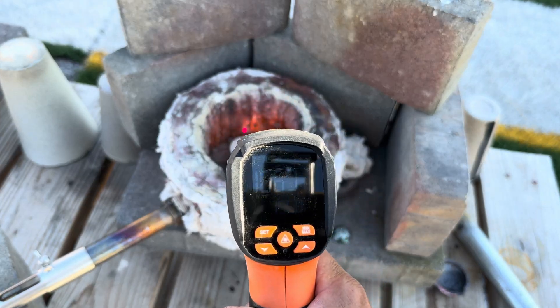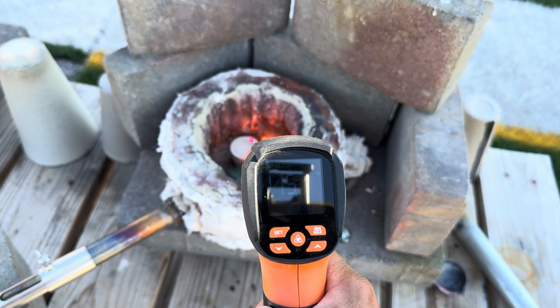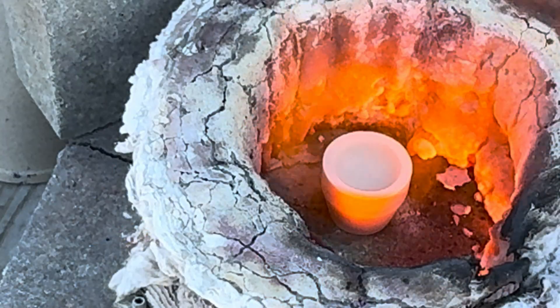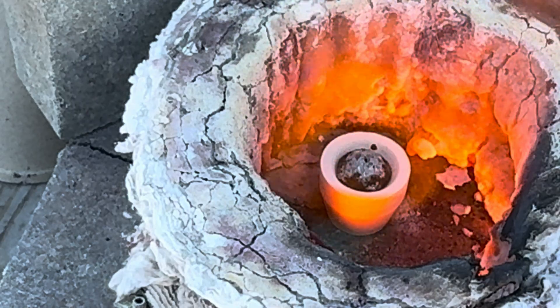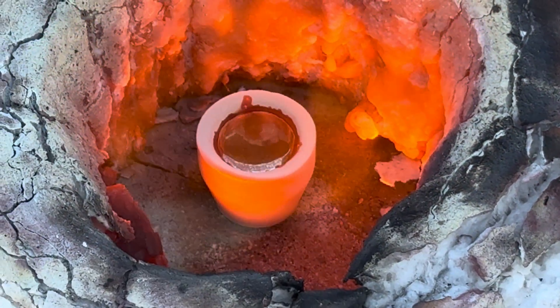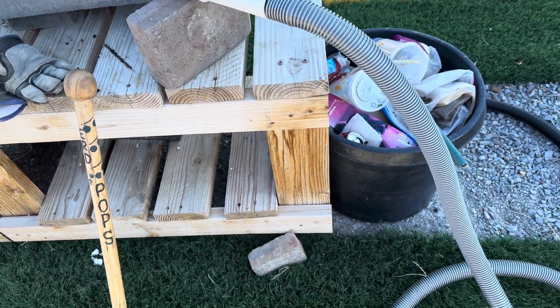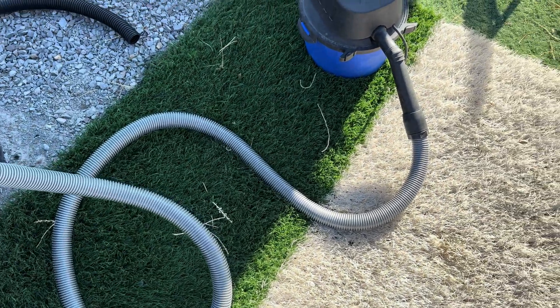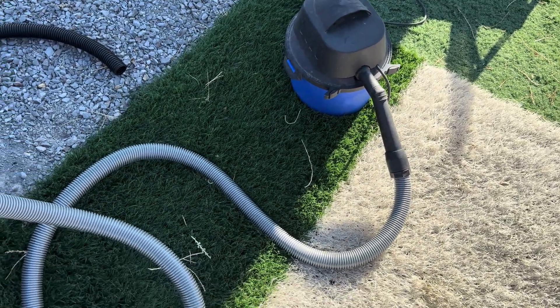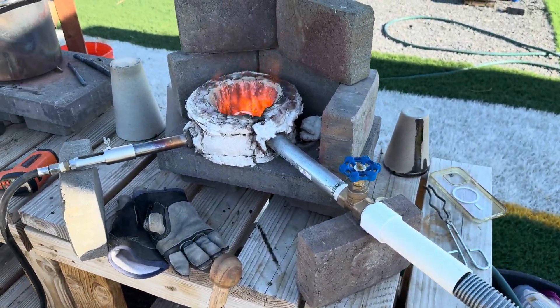Our furnace and cupel is heated up to 1,500 degrees — let's get our lead prill into the cupel. Here is the apparatus I built: it's nothing more than a shop vac, taking the exhaust from the exhaust port, blowing air through the hose and into the furnace where more oxygen reaches the lead prill. This oxidizes the lead and the cupel absorbs the lead oxide.